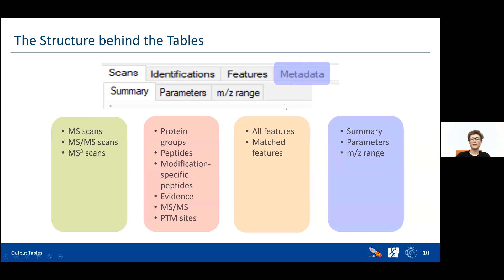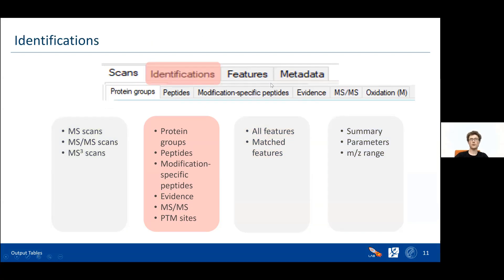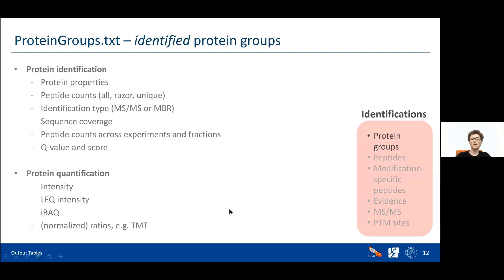Now we're going to go through one class after another to see what information is in there. We'll start with the identifications — the stuff that is most interesting for people doing biological research. We start with the table called protein groups, which is the file proteinGroups.txt.